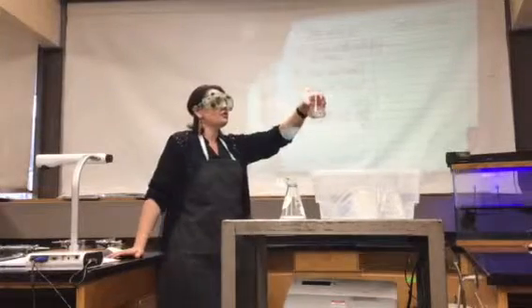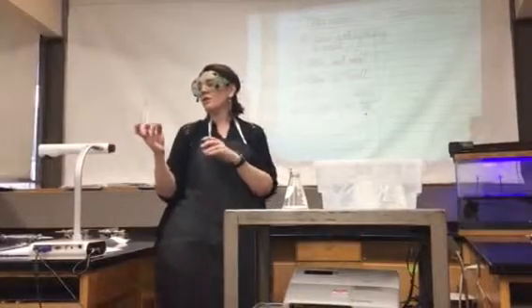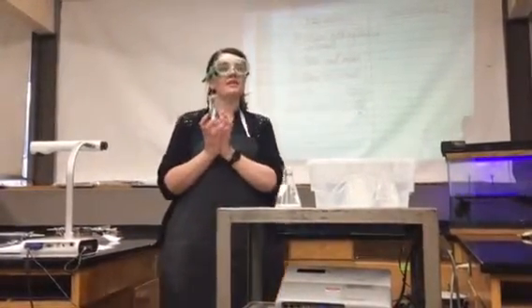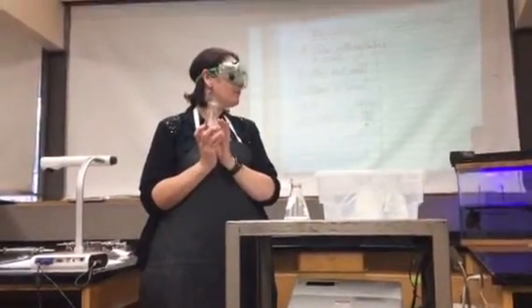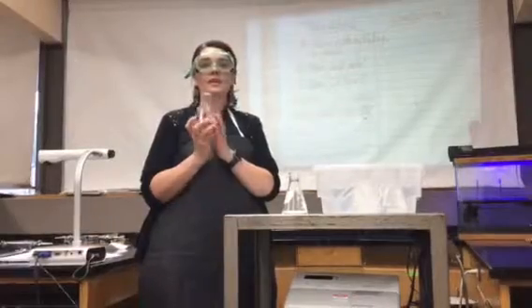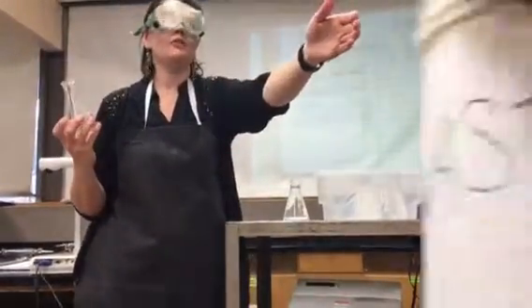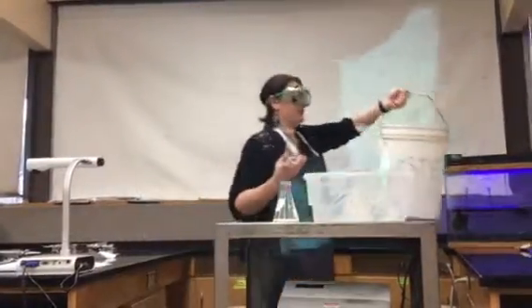I am going to mix these same things together but in a different order. I want to see if the order makes a difference. So I'm going to dump this in my waste bucket. Hey Solomon, want to bring me that big bucket on the floor right there, please? Thank you, my friend. Just a reminder, in this class we never put anything down the sink because it's too bad.